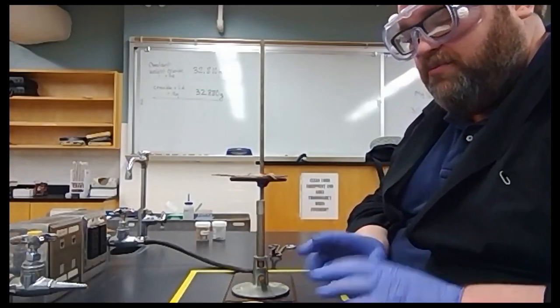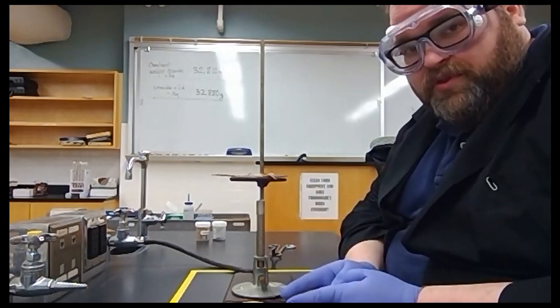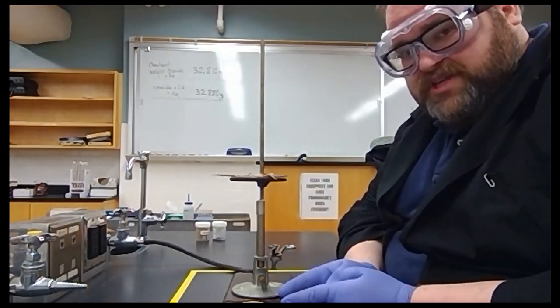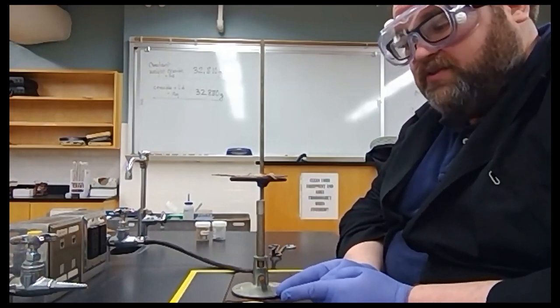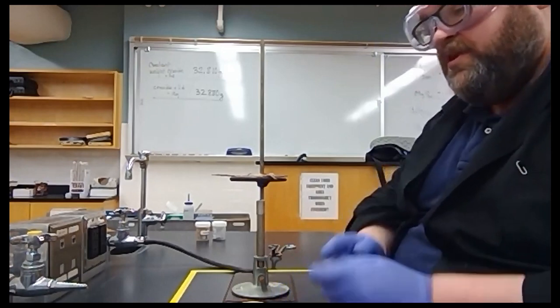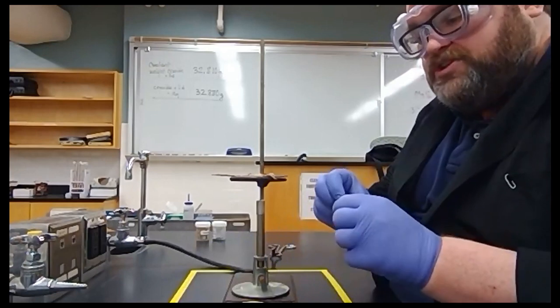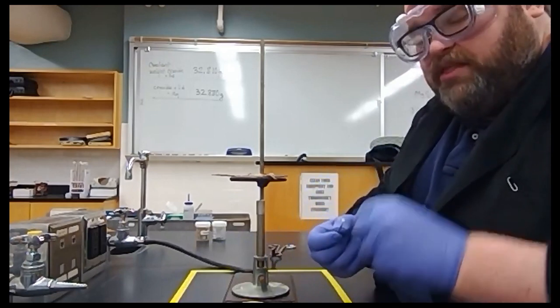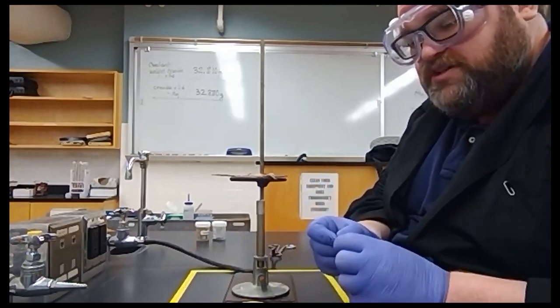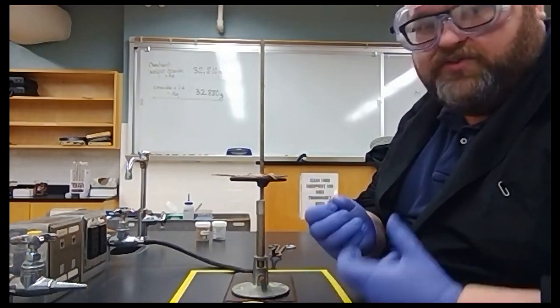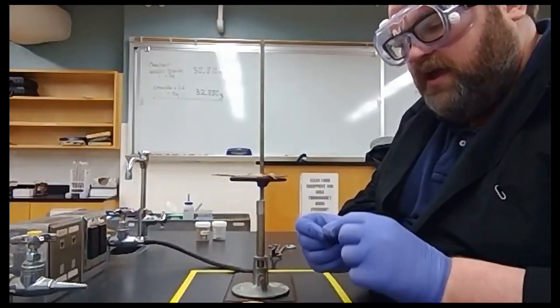Now we have our crucible clean and cooled down. We obtained the mass of the crucible and the lid. We then obtained a small ribbon of magnesium and we took our sandpaper. We just lightly went over the exterior of it to take off any residual oxides, any rust, anything like that that's taken to the outside.